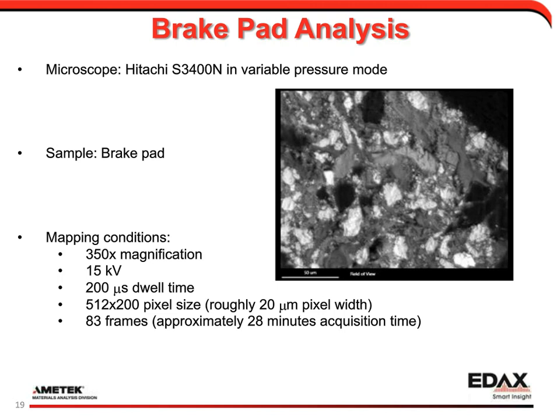That's not a problem. But your acquisition time will usually go up quite significantly in order to get a good signal. And depending on how beam sensitive your sample is, polymers are typically quite beam sensitive, so they won't do well with high beam currents. The answer is to increase your acquisition time to reduce the dose, or basically the intensity, and hopefully you'll be able to get a good spectrum still.